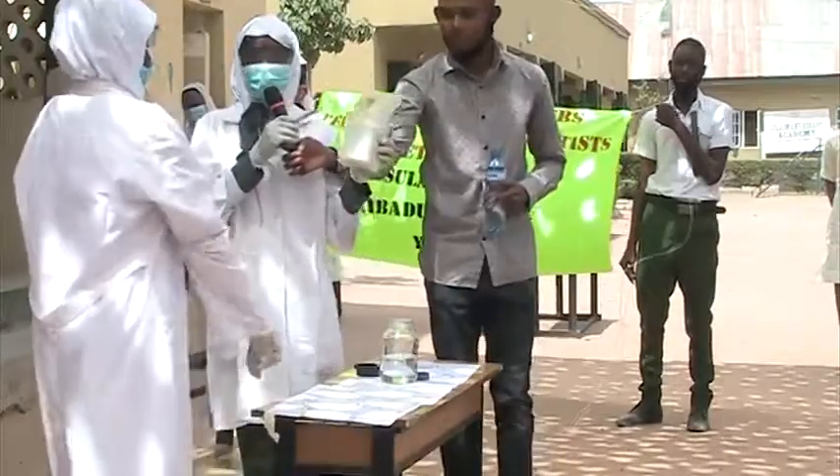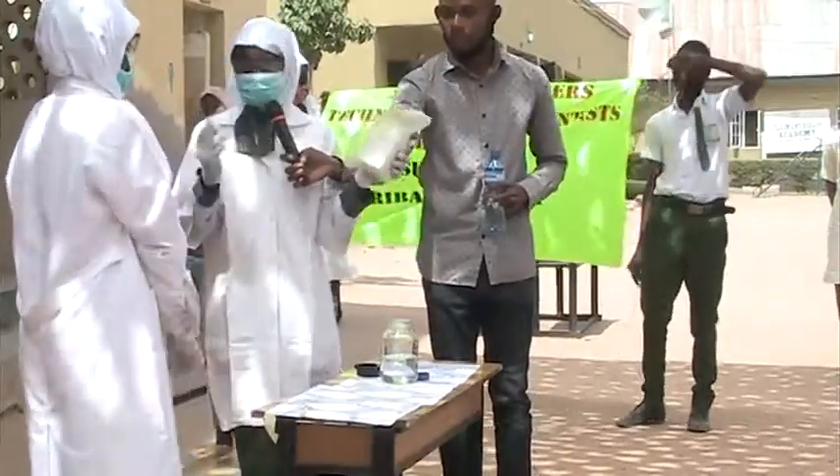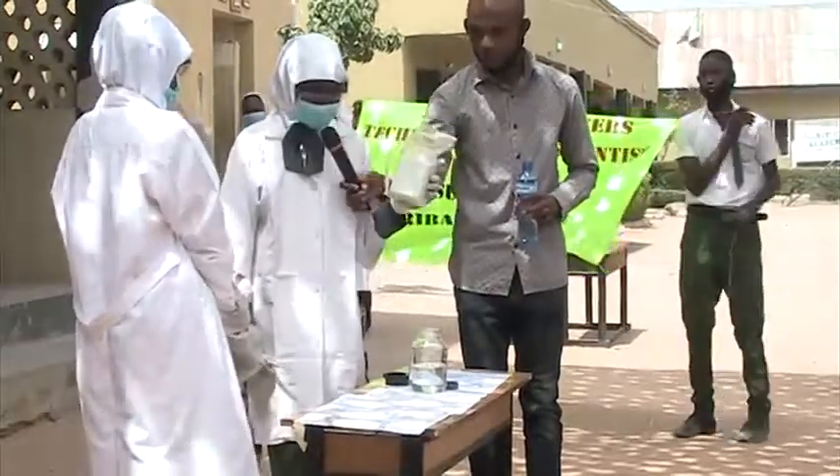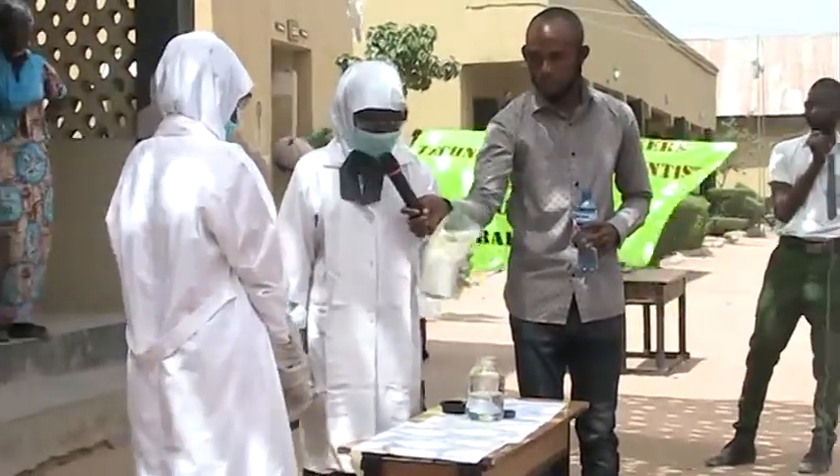This is sodium in paraffin oil, and this is distilled water. It will go now.